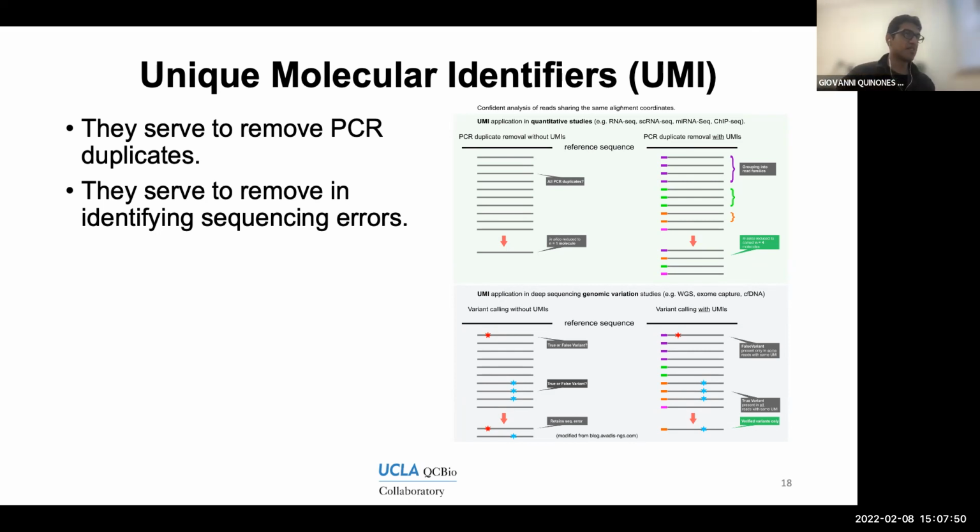Yeah, so just to clarify, these steps are where we are preparing the reads before reading them in the sequencer. So this is the library preparation step. And there was one more question: UMI is basically part of the barcode that is introduced during library preparation? Yeah, exactly. During the library preparation, we'll introduce both a barcode and a UMI to your RNA molecules.